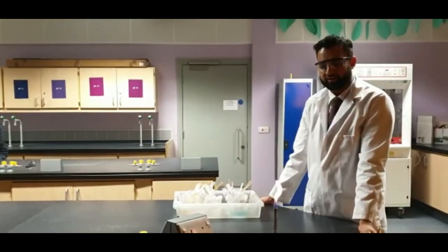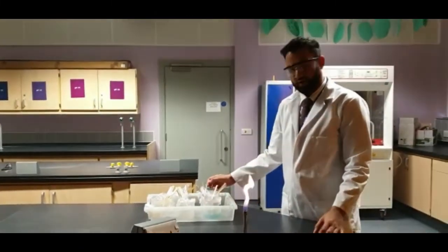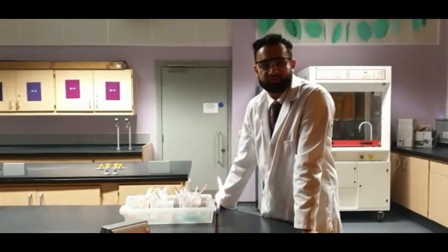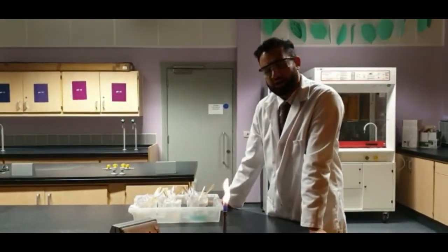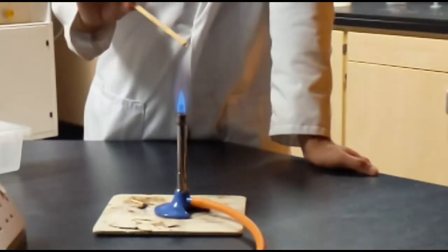Hi, my name is Mr Akhtar, and I'm going to be showing you how different elements burn different colours. Now, you'll know all about fireworks from firework displays on bonfire night, and we're going to have a look at which different elements burn different colours. Now we've got lithium.